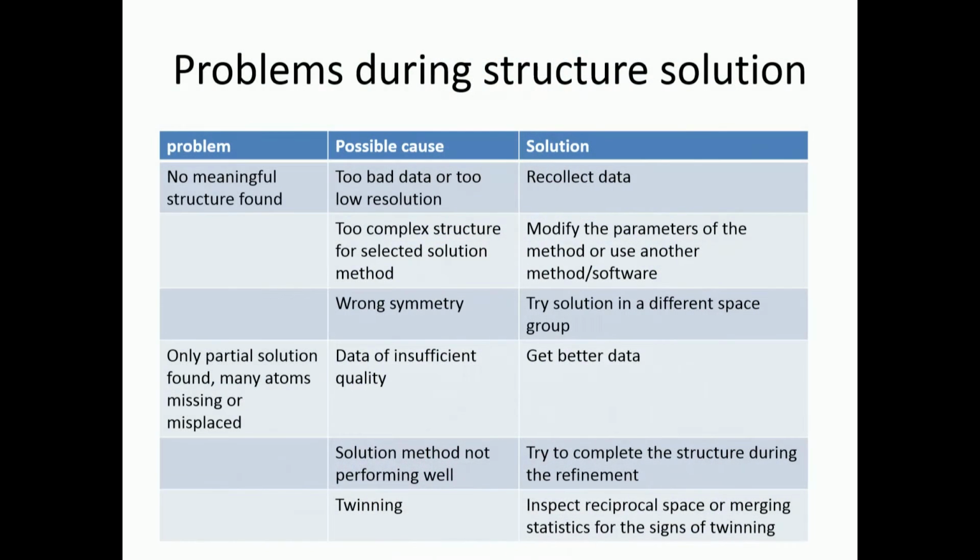Any more questions? Okay, if this is not the case, then let's continue with the next stage of the structure determination process, and that is the structure solution.